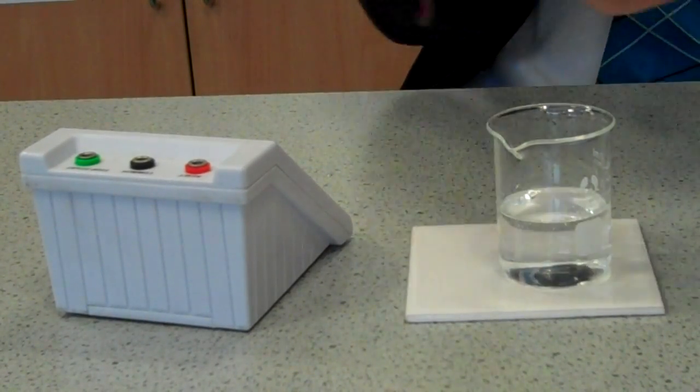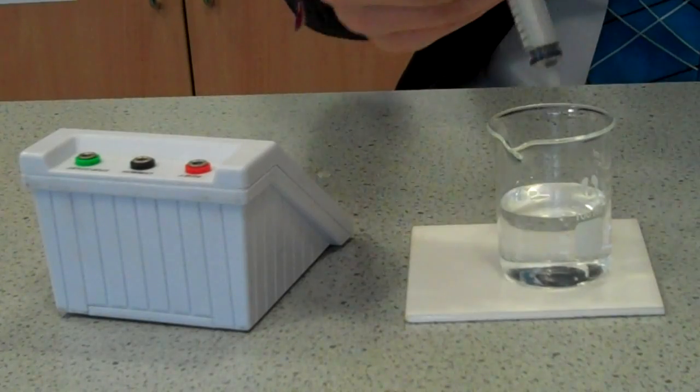We are using starch as an indicator, as when iodine is present it will change from colorless to blue-black.